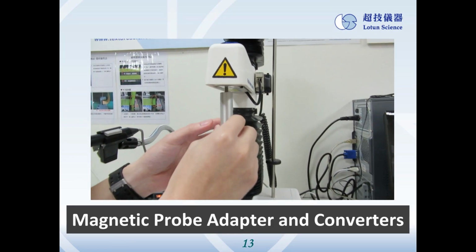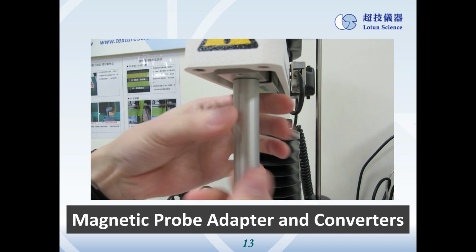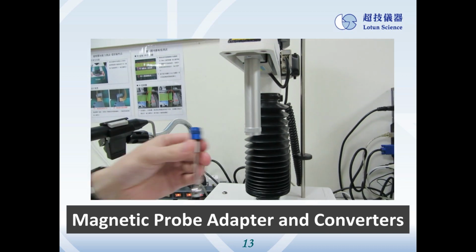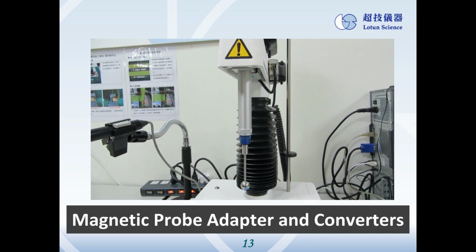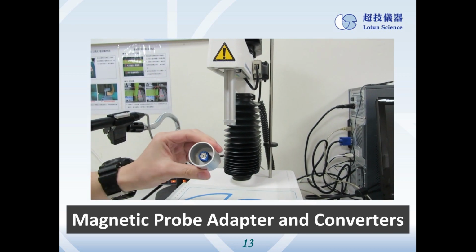Furthermore, we can use magnetic adapters to avoid the damage of probes during different switching stages, as well as saving on the overall time of analysis. All these functions and fixtures can be well executed using a customized sequence to achieve multiple objectives within a short time period.